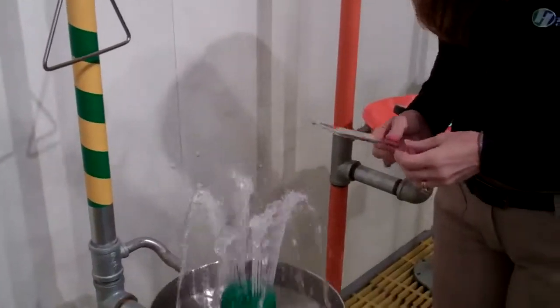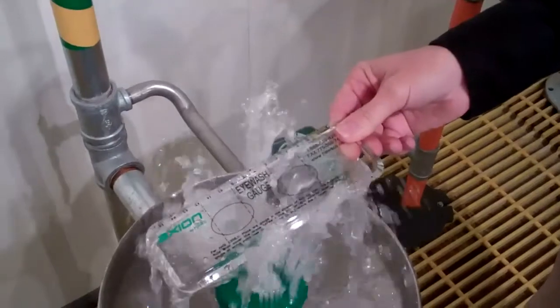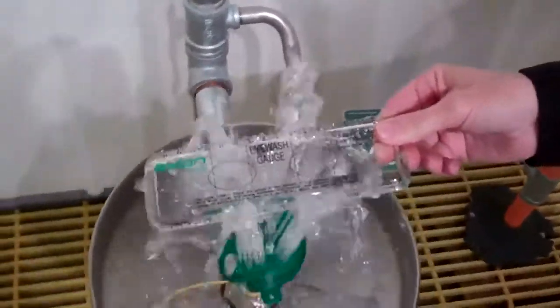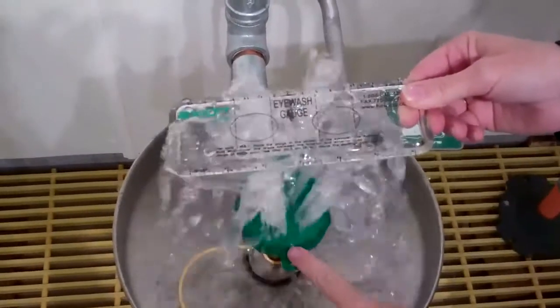You activate your eyewash and then the eye part, you go ahead and put the eyewash gauge in. Now wherever these two points are meeting, you want to make sure that that is no more than eight inches from the face of the unit.